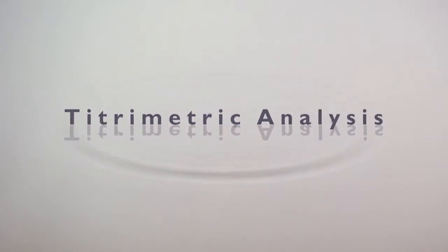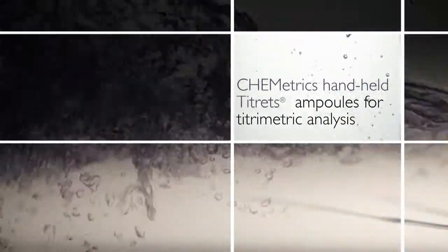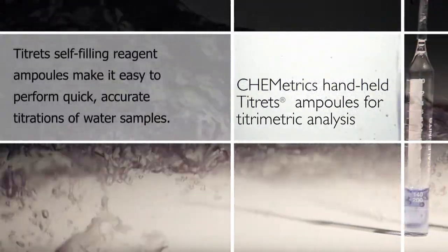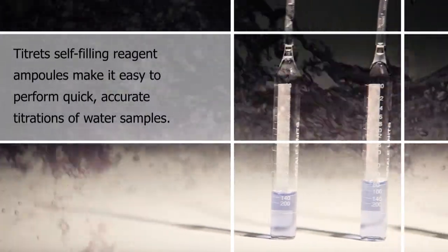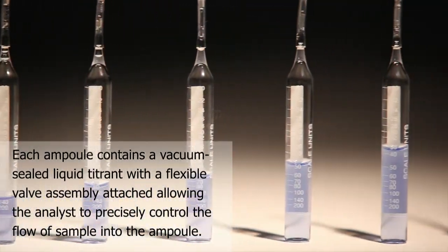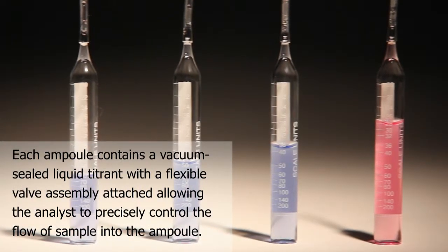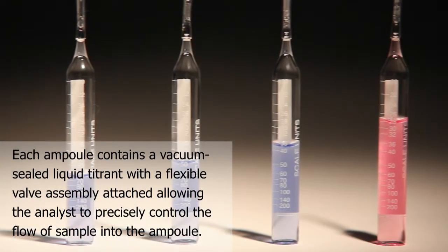Handheld Titretes ampoules for titrometric analysis. Titretes self-filling reagent ampoules make it easy to perform quick, accurate titrations of water samples. Each ampoule contains a vacuum-sealed liquid titrant with a flexible valve assembly attached, allowing the analyst to precisely control the flow of sample into the ampoule.